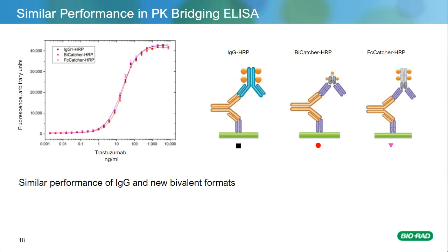One consideration when generating PK assays for therapeutic drug antibodies, in this diagram shown in gold, is that it can be a good idea to capture your therapeutic drug antibody with a monovalent Fab format, because the monovalent Fab format can be coated thinly enough so that in theory it should be spaced far enough apart that only one arm of the therapeutic drug antibody is captured. This should leave the other arm of the therapeutic drug antibody free for detection, which allows the customer to achieve specific capture and specific detection, which can give lower background than, say, specific capture with an anti-Fc detection.